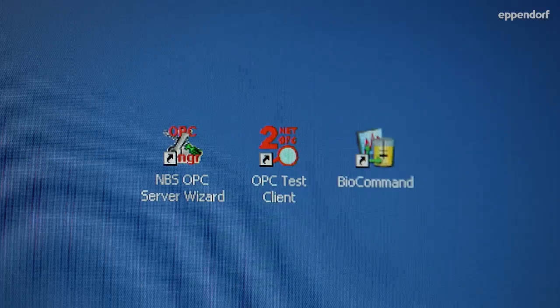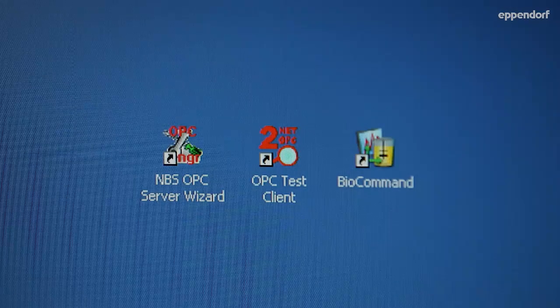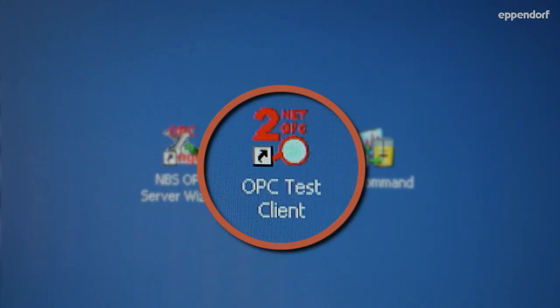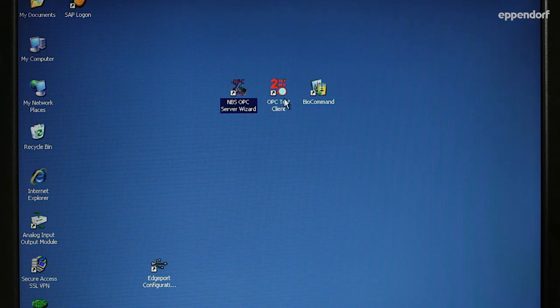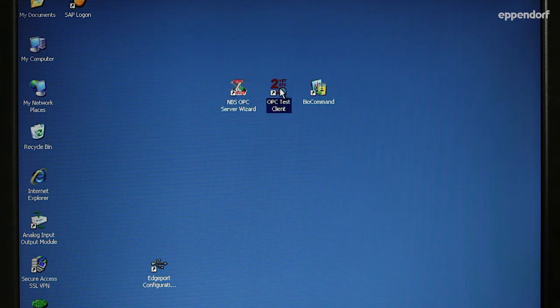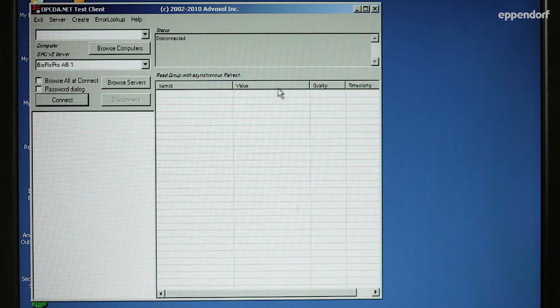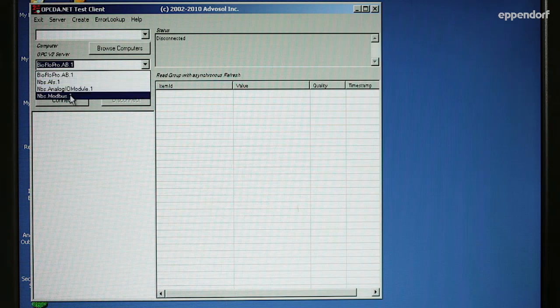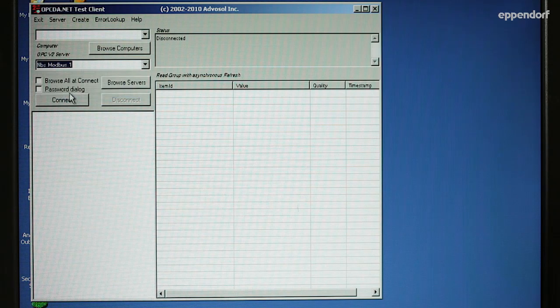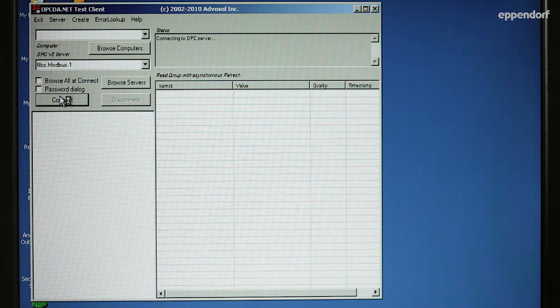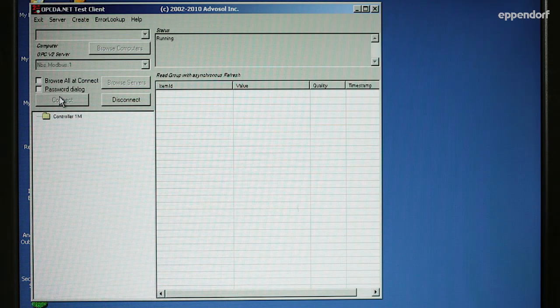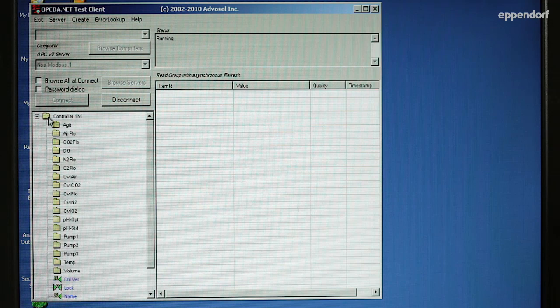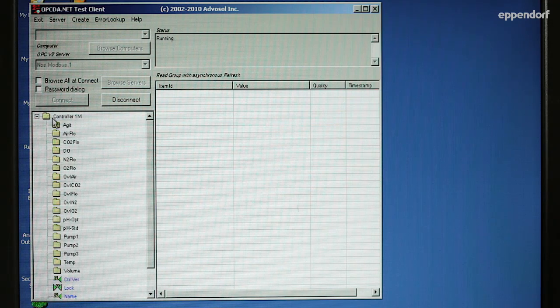The OPC Test Client is a program which gives users the ability to test the controller's communication with BioCommand. To test your connections, click and open the OPC Test Client. Based on your previous selection, select either AFS or Modbus from the drop-down menu, then click on the Connect button. Click on the plus sign next to the folder to reveal the available loops for that device.